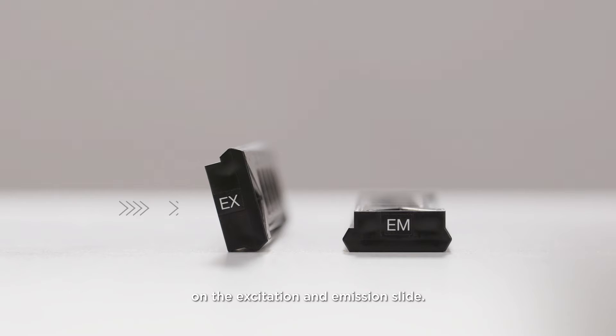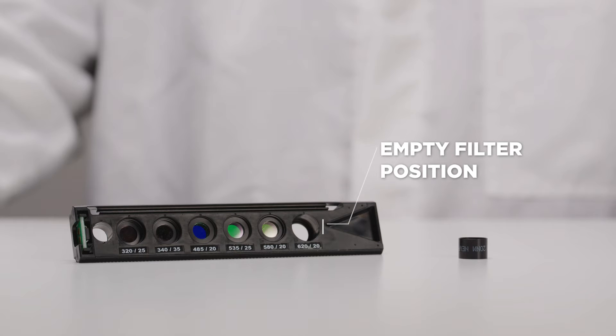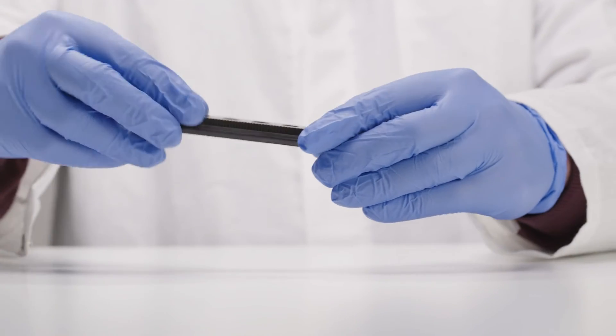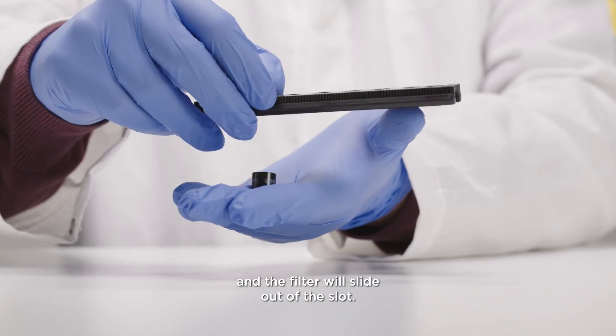Watch the direction of the light path on the excitation and emission slide. Choose an empty filter position to mount a filter. If you have to remove a filter, push the button next to the appropriate filter slot. Turn the filter slide over and the filter will slide out of the slot.